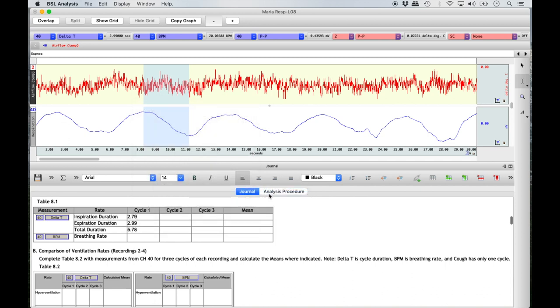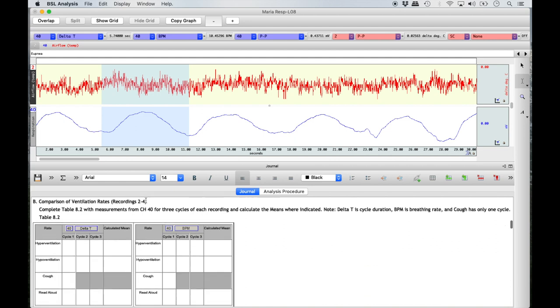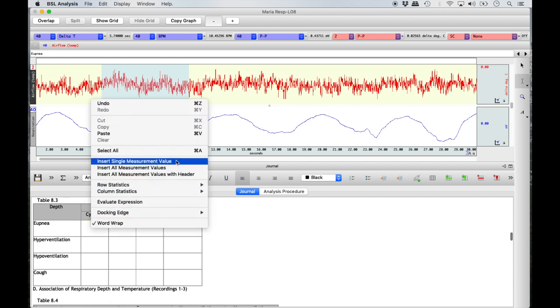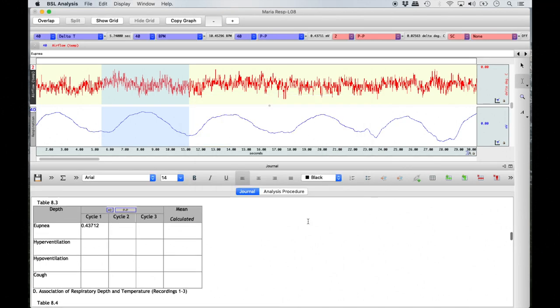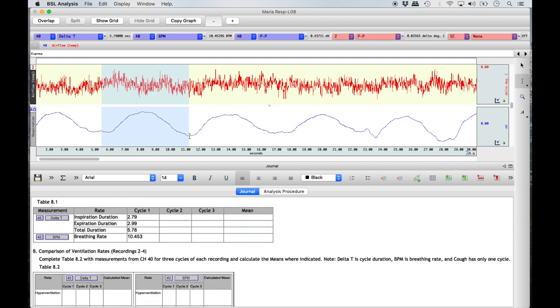To complete cycle 1, measure the breathing rate by bringing your I-beam tool to the beginning of inspiration and highlighting the entire respiratory cycle from valley to valley, including both inspiration and expiration. Right-click in the last row of the cycle 1 column and select 'Insert Single Measurement Value,' then Channel 40 BPM for breaths per minute. With the entire cycle still highlighted, scroll to Table 8.3 and enter the depth of breath for cycle 1 by right-clicking, selecting 'Insert Single Measurement Value,' and then Channel 40 P2P. Repeat the same steps to complete cycles 2 and 3 for both tables.